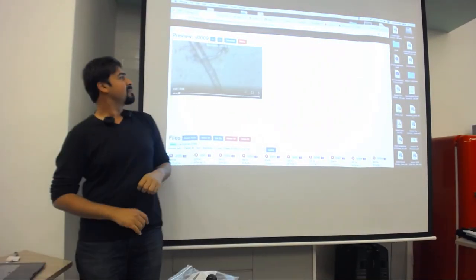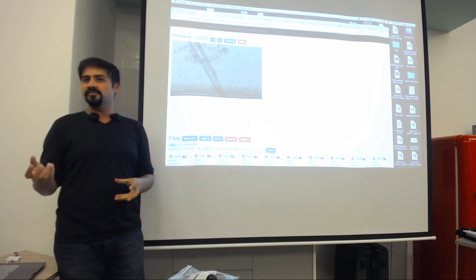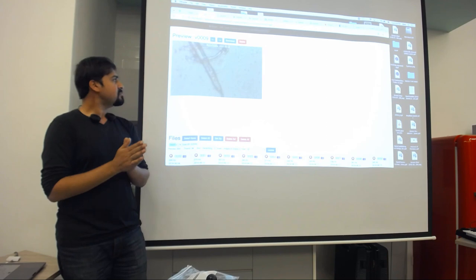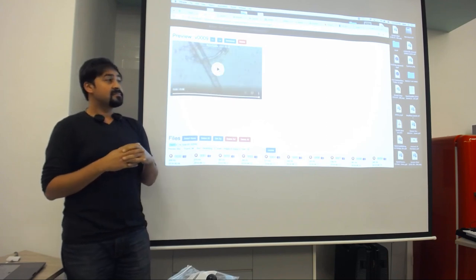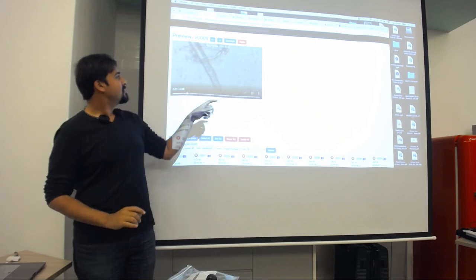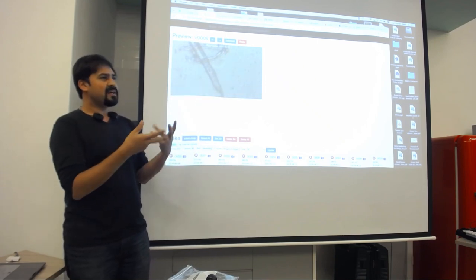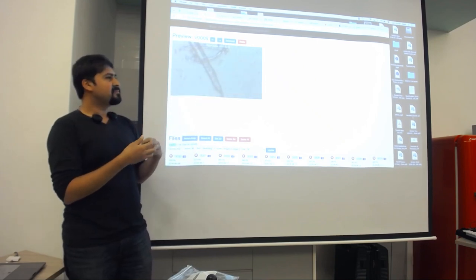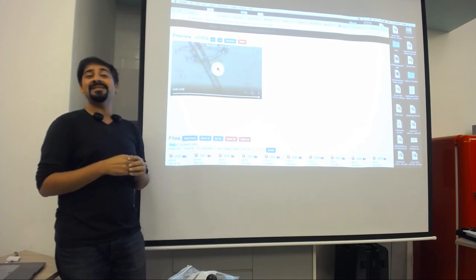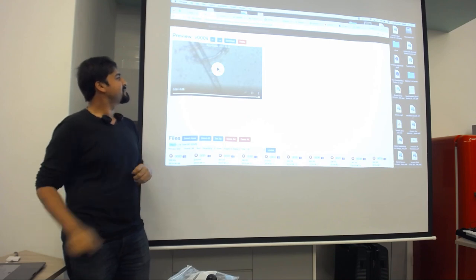What's the sample? It's a water sample. It was in a water plant. Plant pot. Okay. And what's this transparent thing? I don't know, some sort of fibrous, could have been mycelium. I don't know. Dust mite, maybe. It's a dust mite? It might be a dust mite.